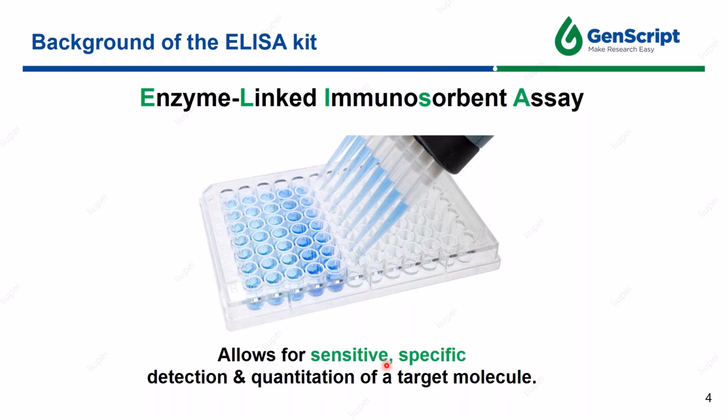The ELISA procedure results in a colored end product which correlates to the amount of analyte present in the original sample. So it's quick and simple to carry out, and since they are designed to rapidly handle a large number of samples in parallel, they are a very popular choice for the evaluation of various research and diagnostic targets.